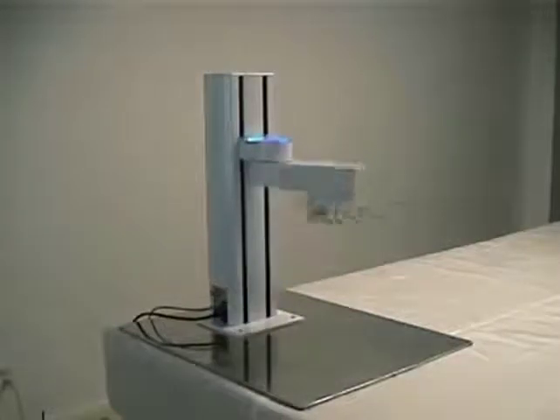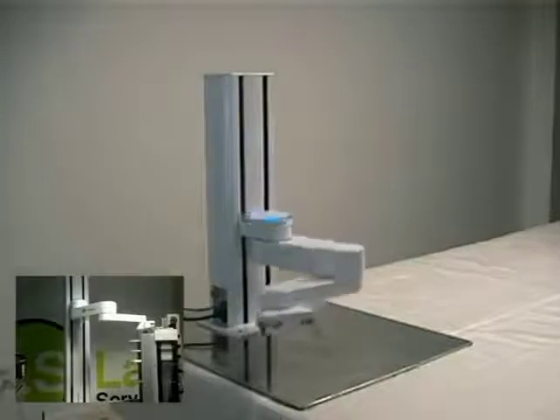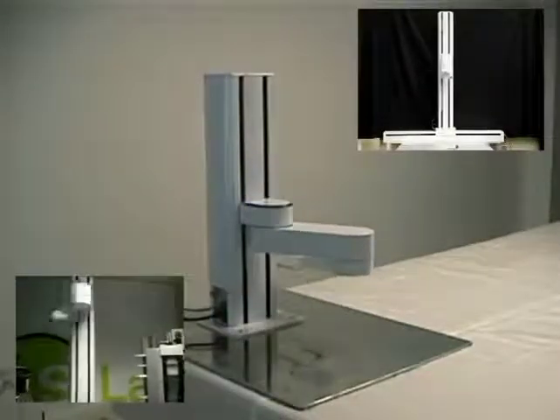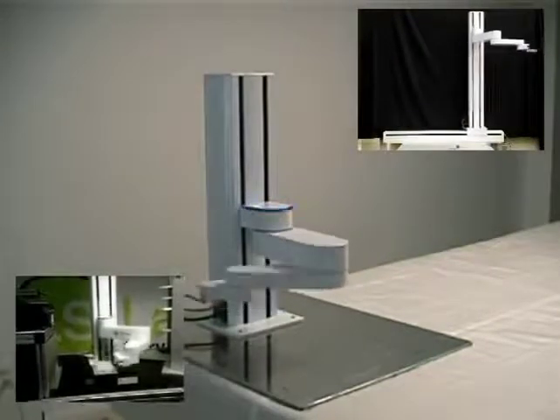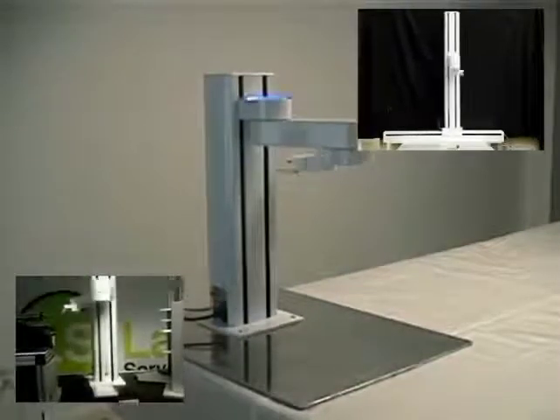The PF400 is available in several sizes and can be easily integrated with Precise's linear rail option to service an extremely wide variety of work cell sizes. All of these robots include a servo gripper which allows the user to control the close distance and gripping force of the gripper fingers.